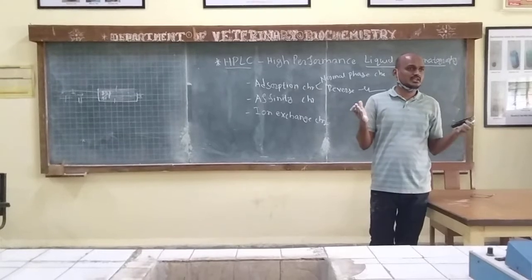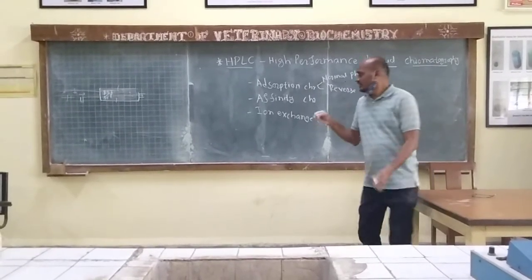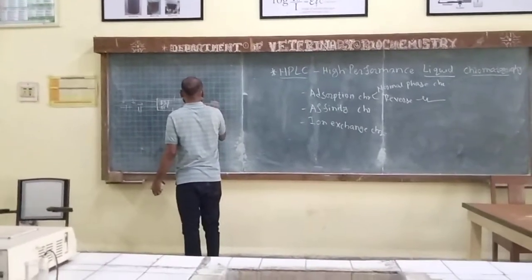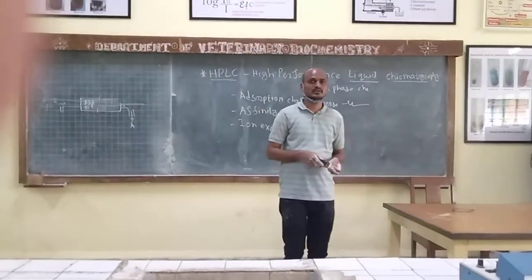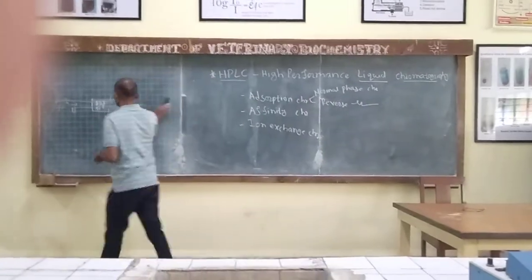So based on pH change, you can do that. And now the last molecule you collect, only one molecule, will be the A molecule. So this is affinity based purification of the molecule. Okay, so you understand this affinity chromatography and chromatography system, right?